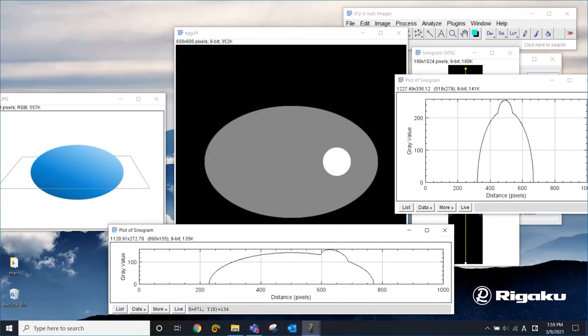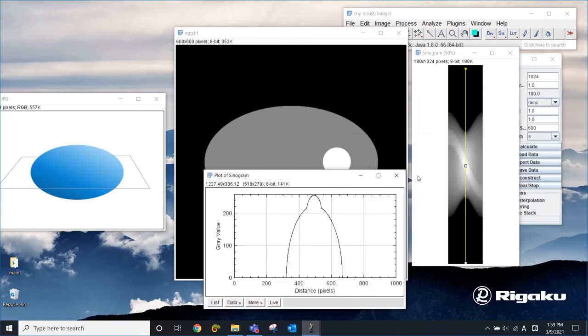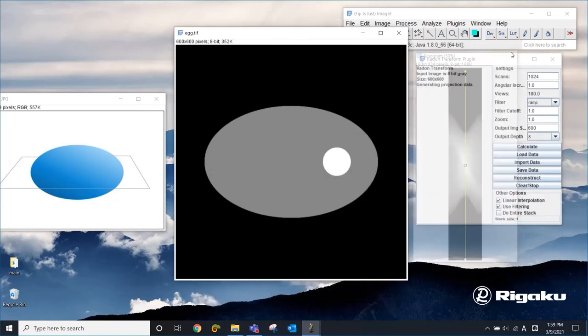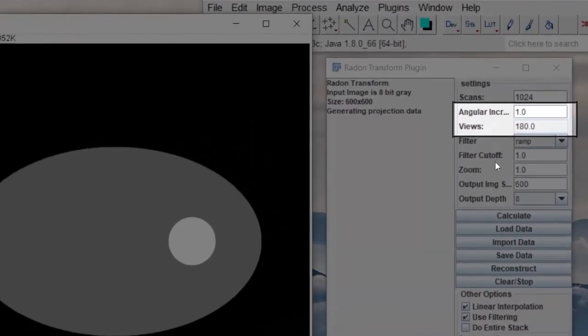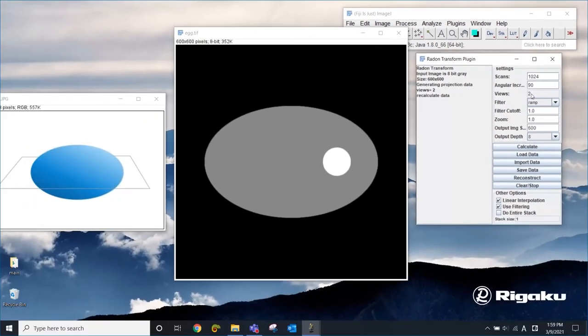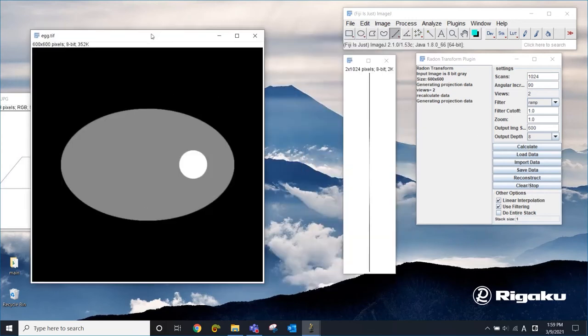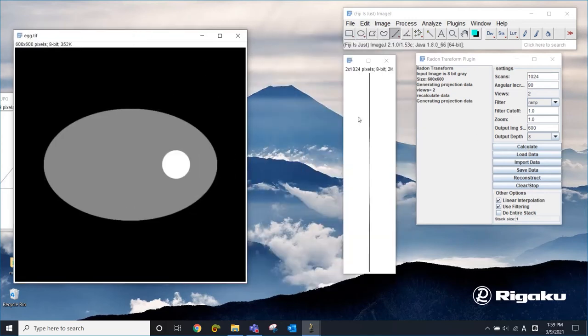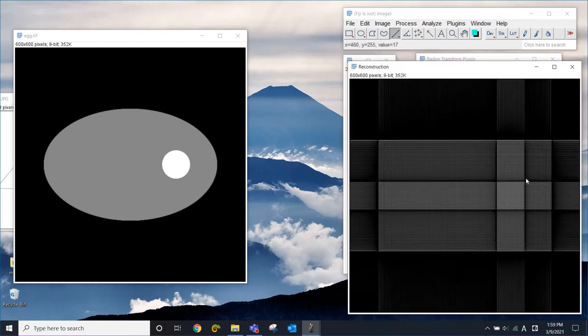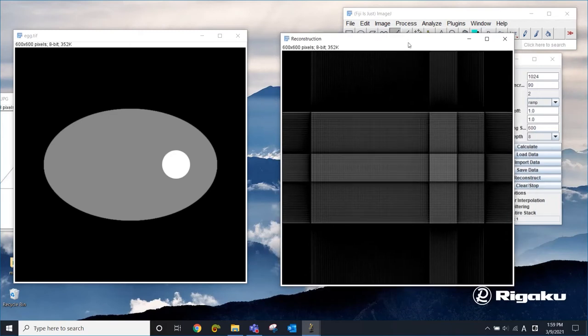Now let's see what happens if we just use those two projections to reconstruct the image. To do that, I have to simulate 90 degree increment that gives us only two projections. So I'm going to calculate two projections. This is our CT scan. Let me put this over here. I'm going to use only those two projections to reconstruct the cross section. And this is what we get.